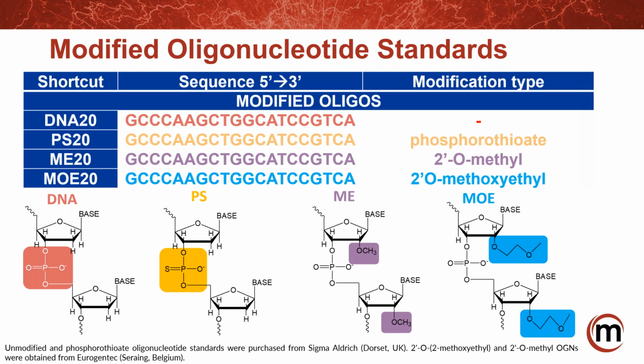So we had to work with collaborators to get the modified analytes, and some of it is modifying on the backbone, and some of it is modifying on the actual nucleotide sequence. And so the impact here is the stability for the oligo therapeutic analyte, whether or not it is bioavailable or controlled.